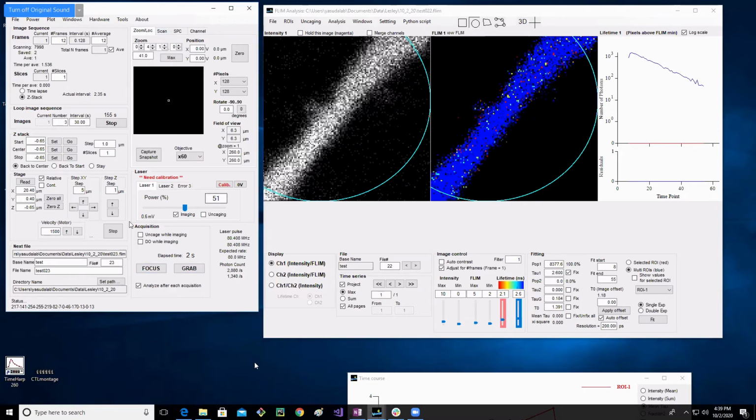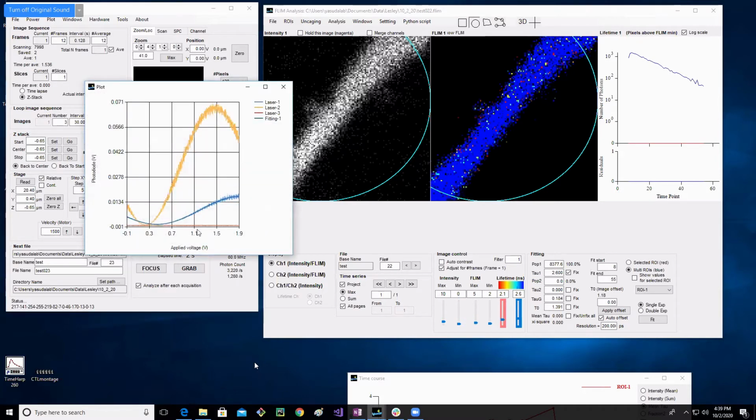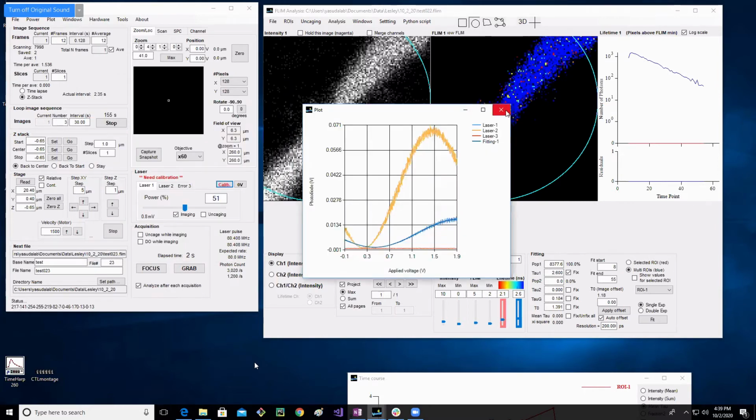Alright. Now calibration curves, I think probably you guys have already talked about that. You want to make sure you have a nice calibration curve, with a minimum and a maximum for each laser that's on. Measure your power every day before you start doing experiments. If your calibration curve ever looks a little wonky, this also should give you an error like this, error 3 decalibration.